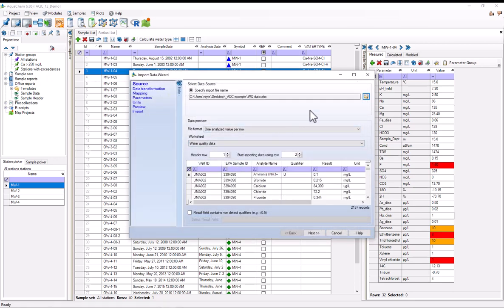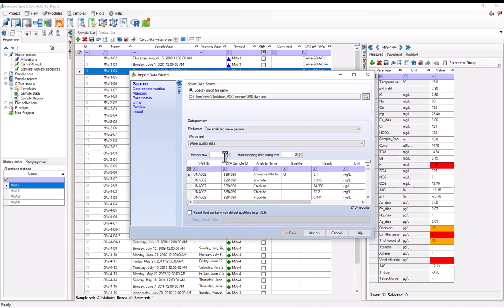As I mentioned, I already pre-formatted this spreadsheet so that I wouldn't need to do it in the software. So as we can see, we've got one analyzed value per row. The header row is row 1, which is the default. And we're starting to import from row 2. We'll hit next.